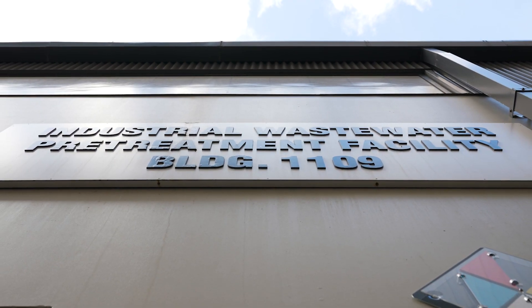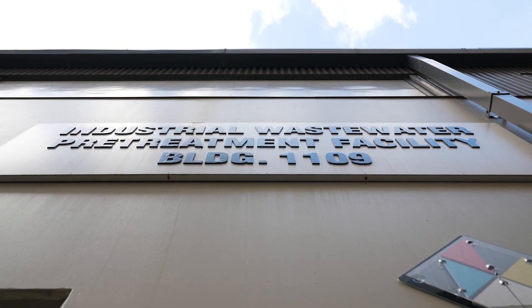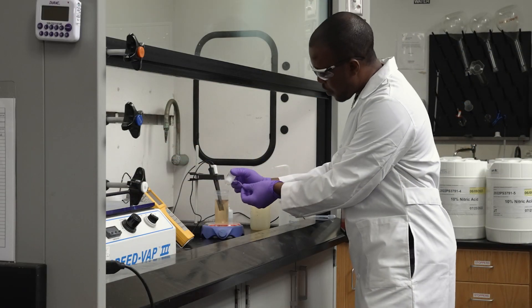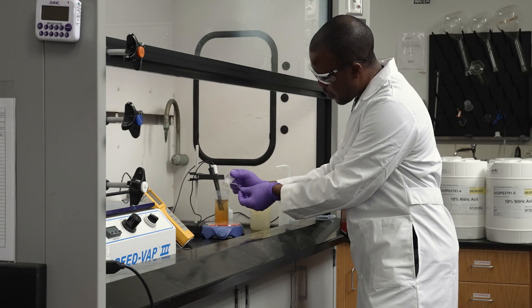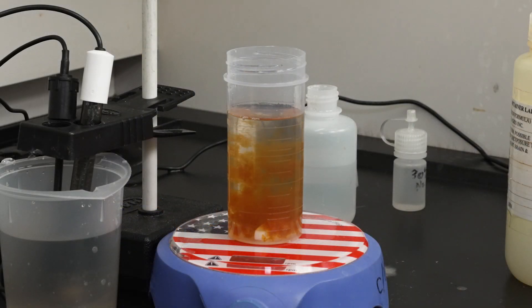The shipyard has treatment facilities for waste water. To be sure the treatment process works, a jar test is performed on waste water samples. In this simulation, any heavy metal should start to precipitate and ideally settle to the bottom.